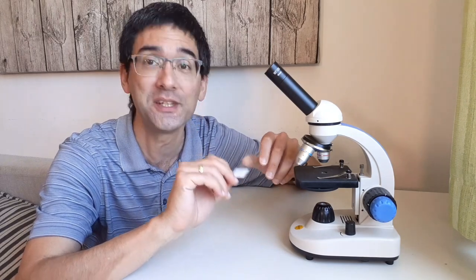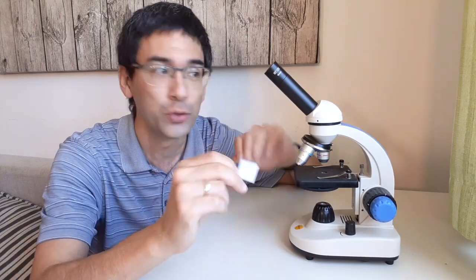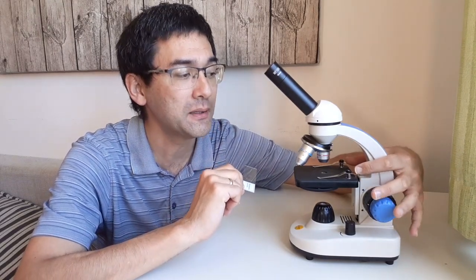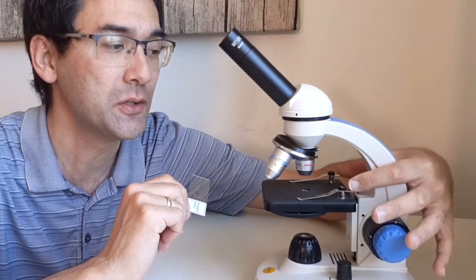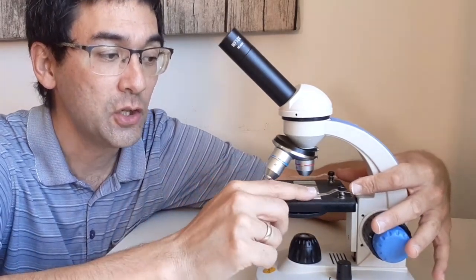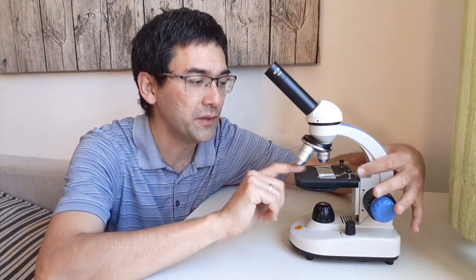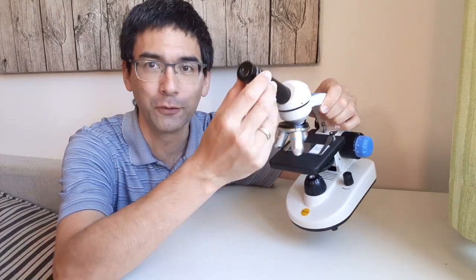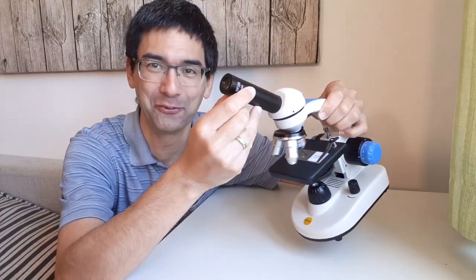The first thing that I want you to do is take a slide. Usually a microscope already comes with a whole box of prepared slides. You want to press the back of the stage clips here and then you can see that they're raised up and you can put the slide in. You always want to put it in with the label on top. Once you've done that, then the slide is not able to fall out.